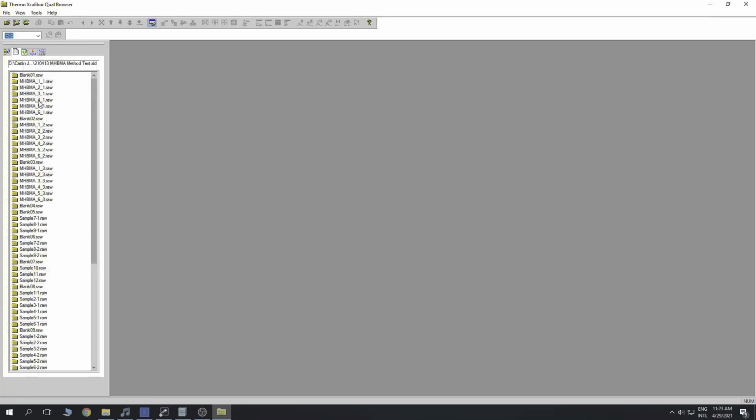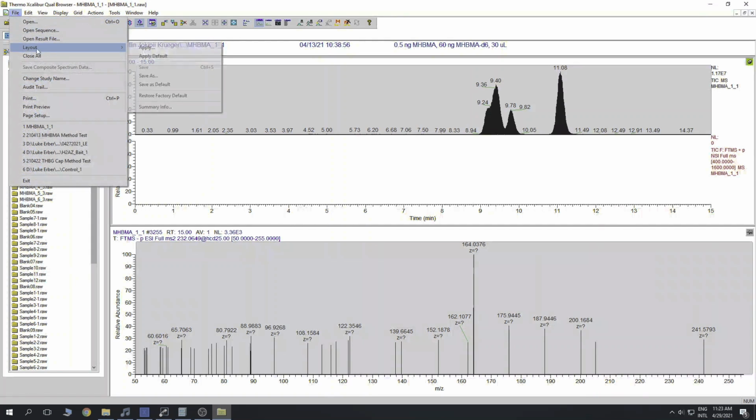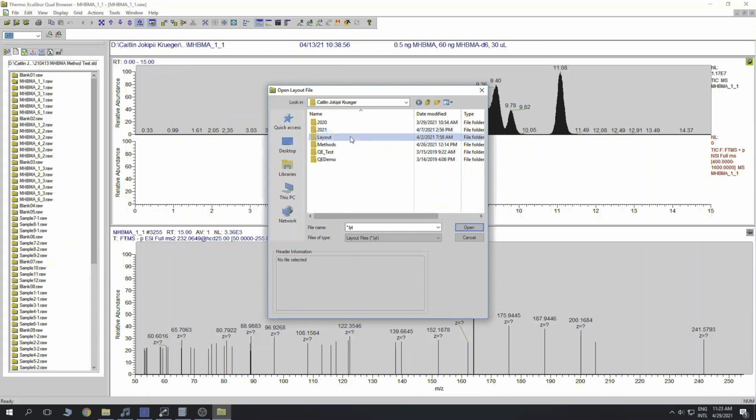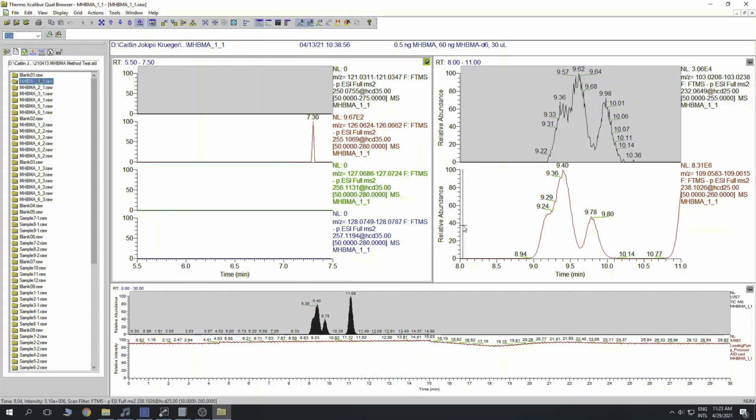To change the layout of what this window here is showing, you go to File, Layout, and Apply. And then you'll want to find the layout file that has already been saved that is the appropriate layout for what you're looking for. So I'm going to apply this layout that I've used for these types of samples. And so now you can see what your sample looks like and what the pressure is.